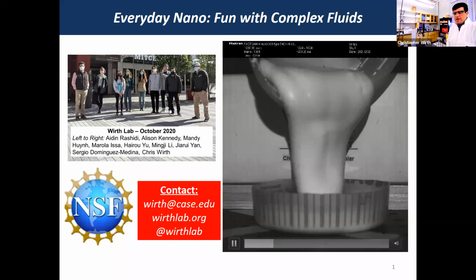This particular microscope is utilized for a project on coatings, drying thin films, that's funded by the National Science Foundation and in collaboration with PPG. So those are a couple major tools in our lab. We also have another room in our laboratory. So it's a little bit loud, but this is actually a clean room. So the circulation of air through this room is regulated to minimize the amount of dust that appears. And again, we have a couple microscopes here.